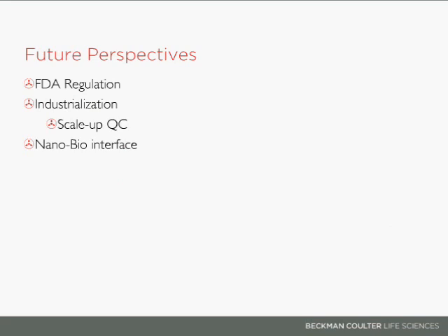You can't run 8 different analytical techniques at the end of a batch every single minute to be able to make sure that your process is working well. It'd be best to have one single reliable technique, and AUC, in my mind, is really one of the most powerful techniques to fully analyze nanoparticles.